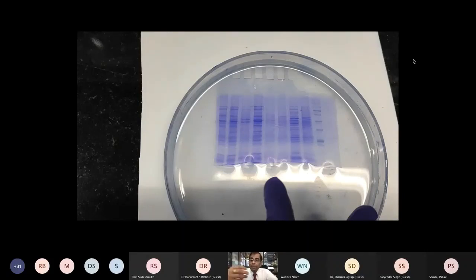Sometimes even the nucleic acid can also bind to these dyes, and they give you some artifactual values, which apparently look very high to you, and you feel you got too much protein, but you may not have sufficient protein from the given sample. So doing a QC check of the nucleic acid contamination is of course important. You can always say that okay, I have used some nucleases and that has been removed, then that is fine, then you are sure about it.